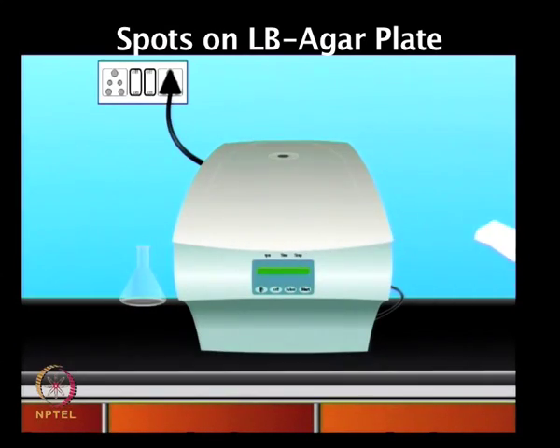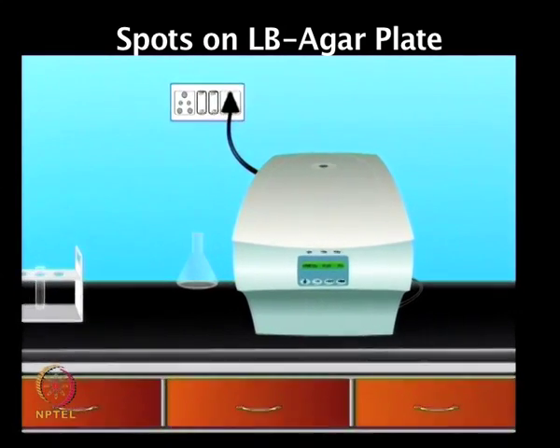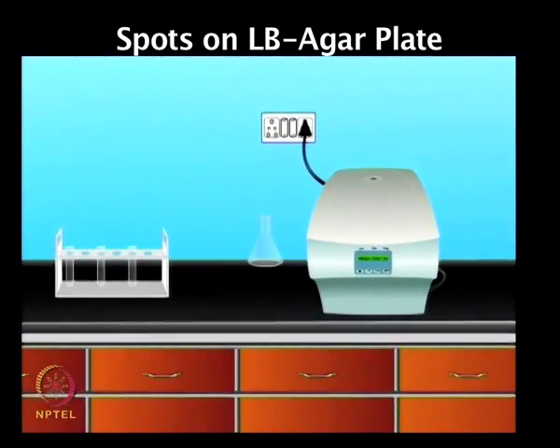Once the centrifugation is complete, the bacterial pellet will be in the well and then you need to remove the supernatant.